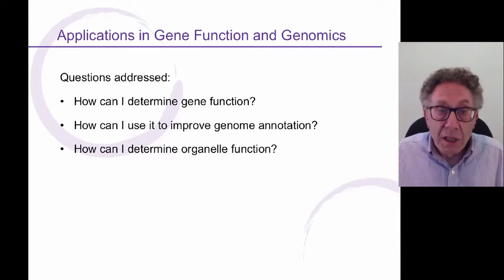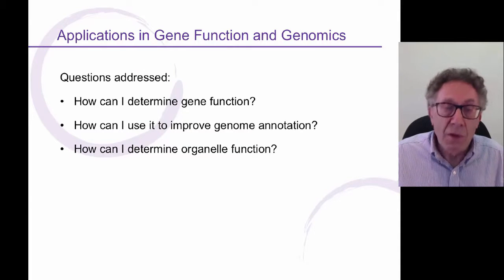For the next section, I'd like to talk about applications having to do with gene function and genomics. The questions that we'll address include how you can determine the function of a gene, how you can improve genome annotation, and how you can even determine the function of an organelle.